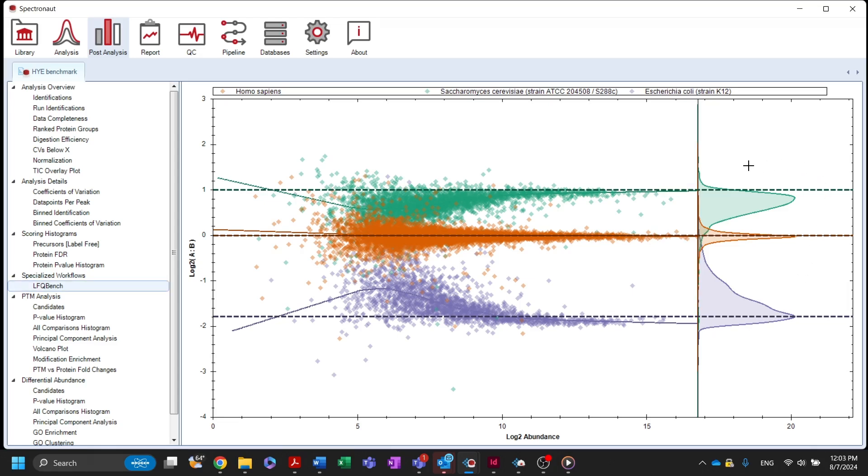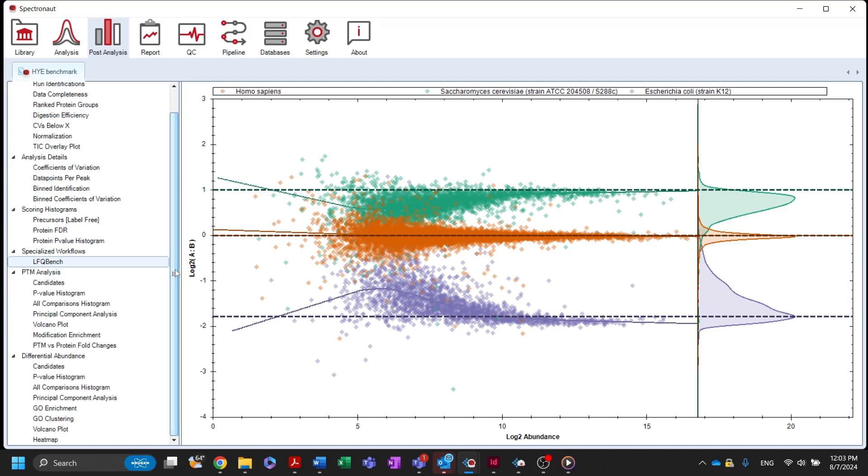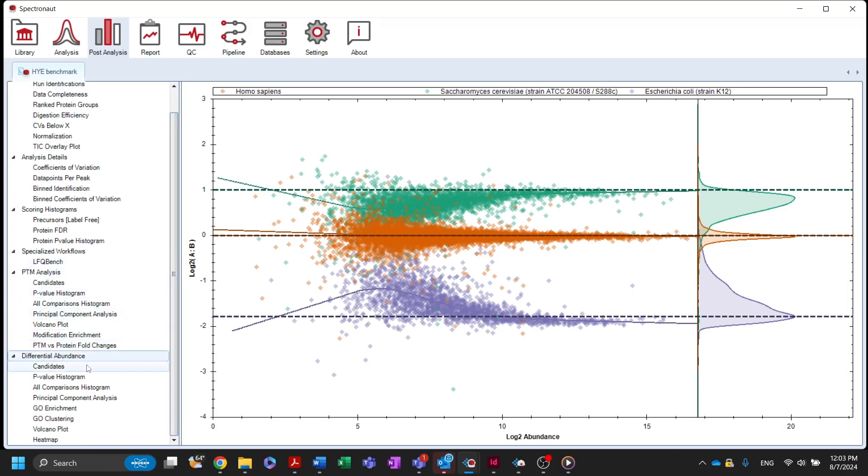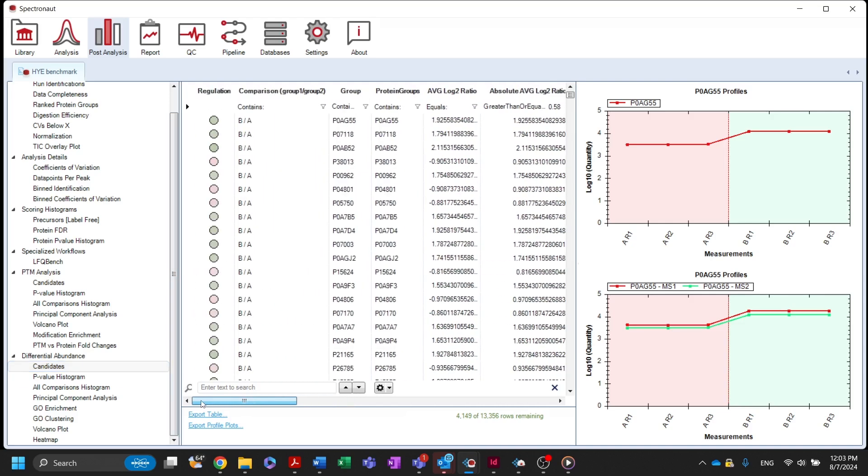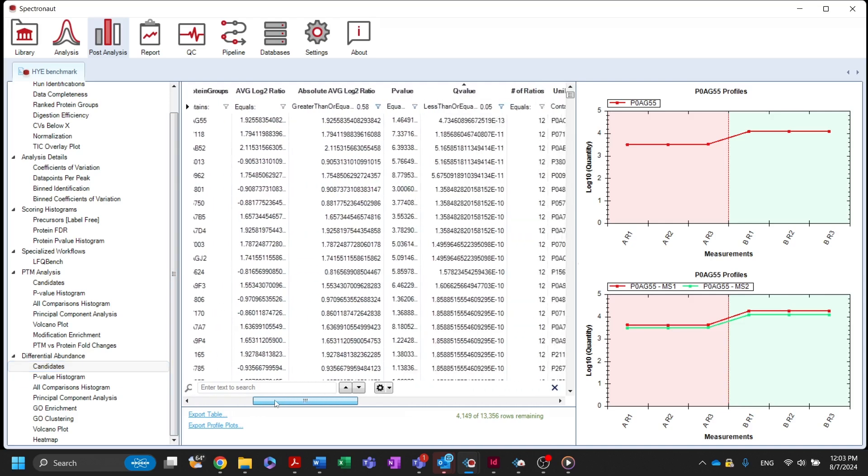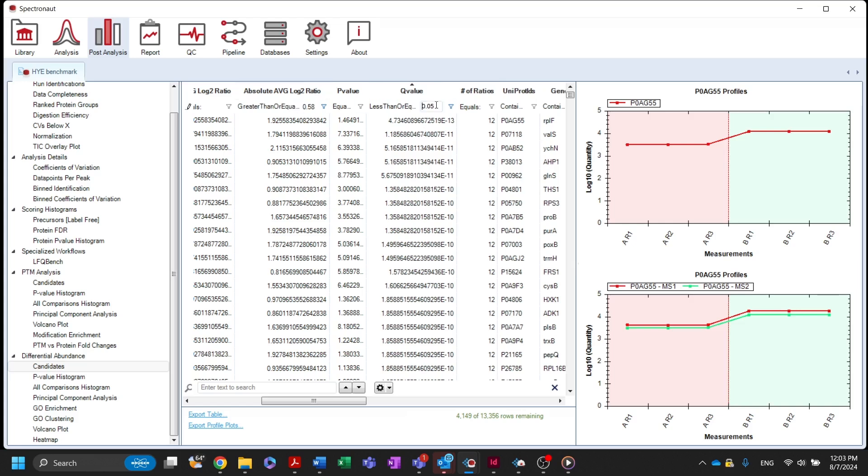Plots related to the differential abundance testing performed in Spectronaut can be viewed in the differential abundance section. Proteins that are differentially regulated between experimental conditions can be found in the candidates list. By default, this table is filtered by a Q-value of 0.05 and an absolute average log2 ratio of 0.58, but you can change these filters based on the preferred cut-off values.